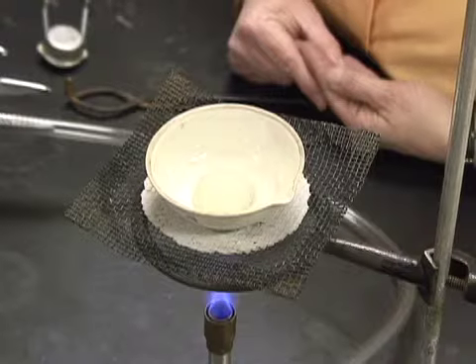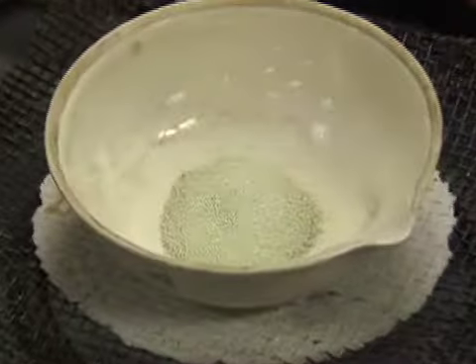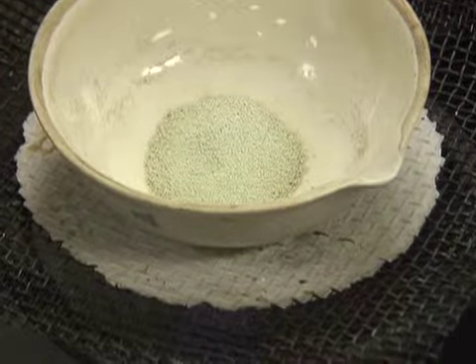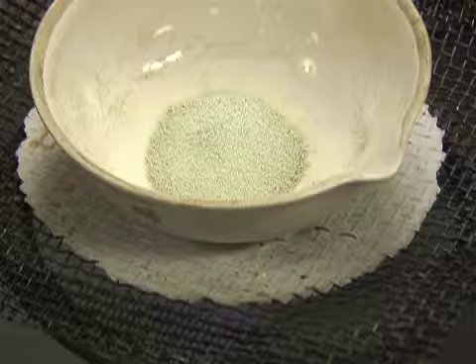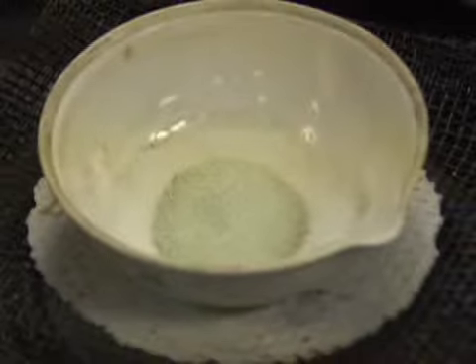Well, this calls for a decision. The person doing the lab has to decide: is it dry? Is it not dry? Has it been heating long enough, or should it heat longer? Well, whenever in doubt, heating longer is always a good idea.